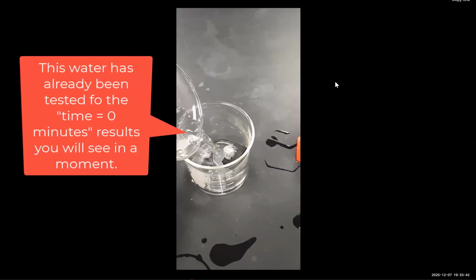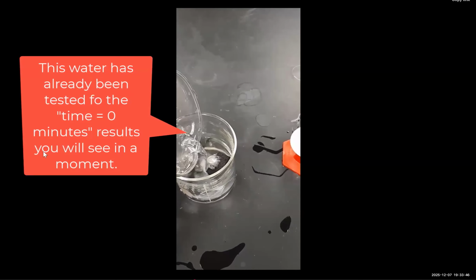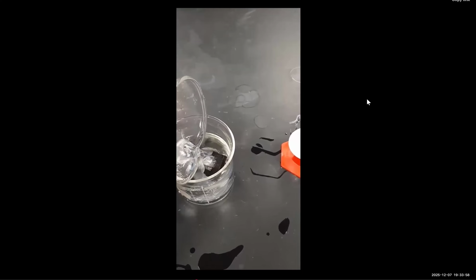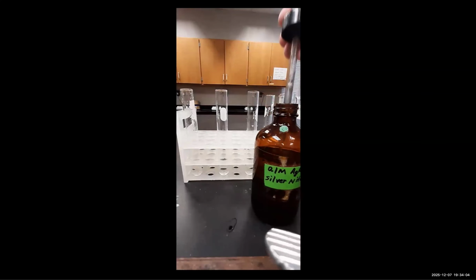They're then going to pour deionized water into the beaker. This water has already been tested for time equals 0 minutes. We've tested this deionized water for glucose, starch, and chloride, and we're going to see that in a moment. So now they've set up the dialysis bag. They have a beaker filled with deionized water, and dialysis is proceeding. During this time, we're testing the beaker water at 0 minutes.